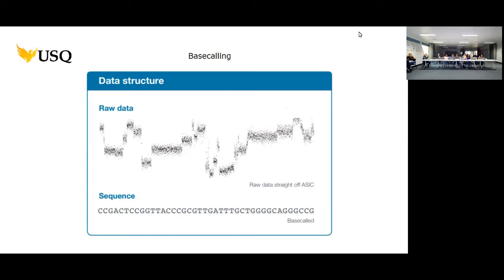And that all depends on how much data, how good your sequencing run is. If you've got a really good sequencing run on, you're going to generate lots of data really quickly, and it's going to struggle to keep up. So we've got a bigger computer up in Dbook, we call it the supercomputer. In most cases, it can keep up with base calling. But if you generate a lot of data, it might take another day to finish the base calling. So just allow extra time when you're planning for your actual sequencing run, that this component will take quite a bit longer.